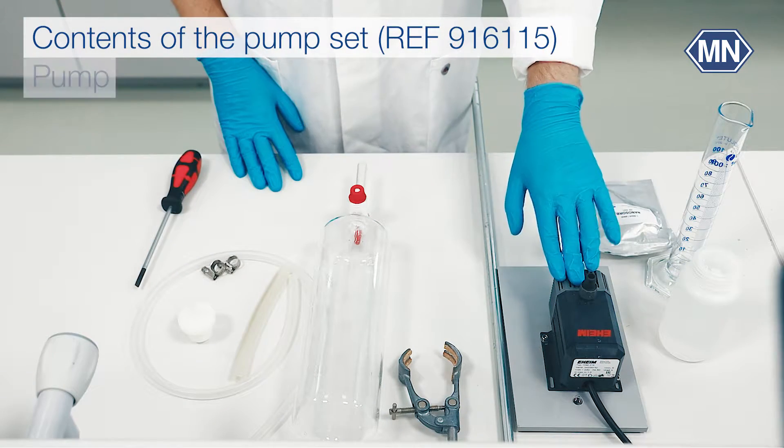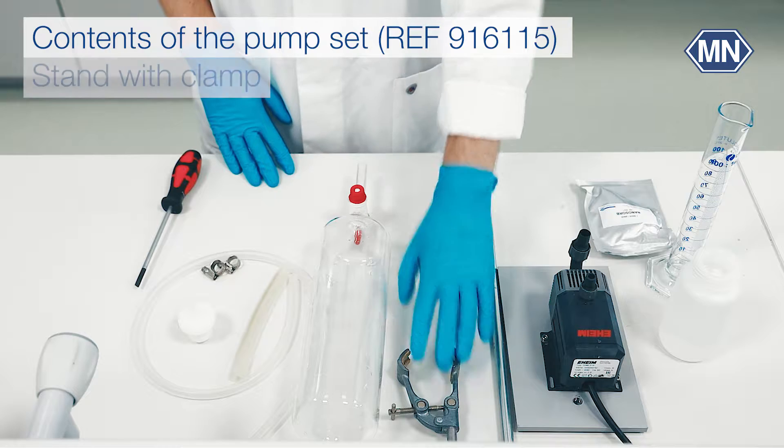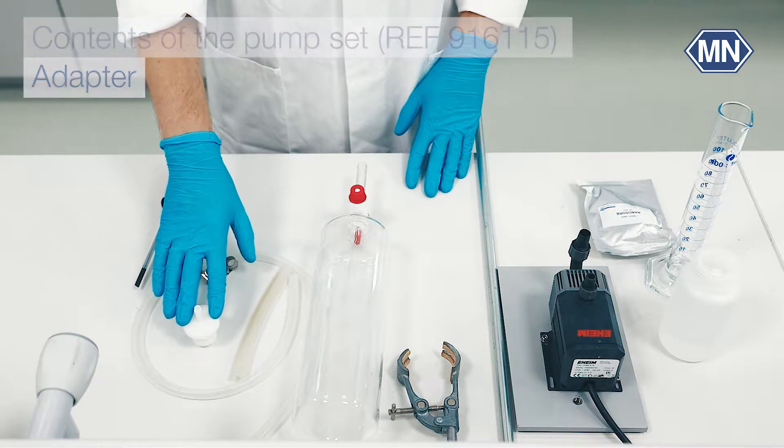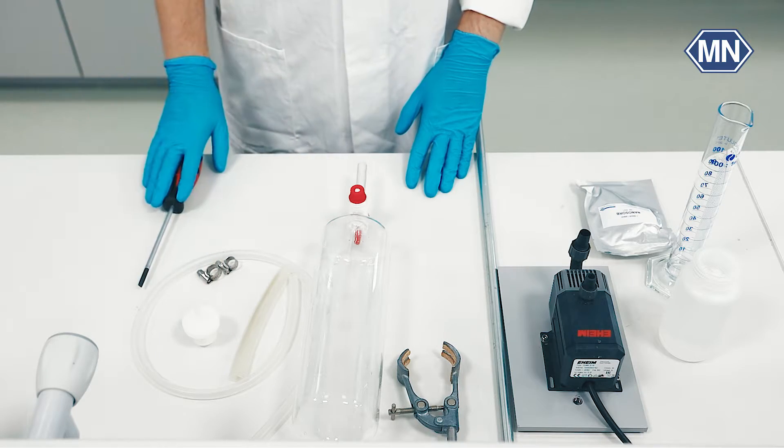Our pump set includes a pump, a stand with clamp, a reservoir, tubes, tubing clamps, and an adapter. In addition, you need a flat-headed screwdriver.